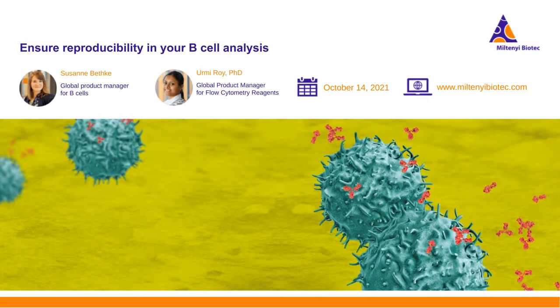It's a flow-based system where you can stain your B cells with the antibodies, and then you can use the antigens of interest, couple them to a bead, for instance, to do it with a column, or you can also use the protein and label it with a fluorochrome so that you can make it visible in the cytometer.